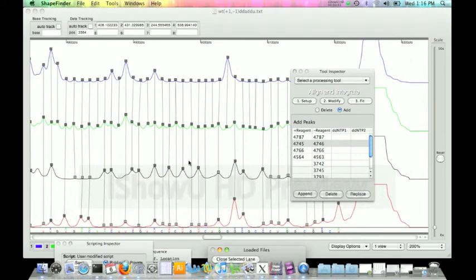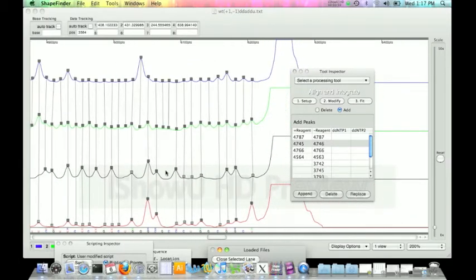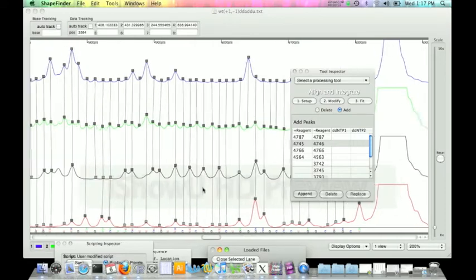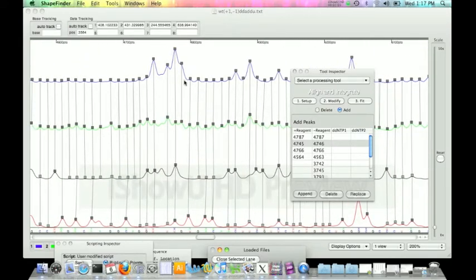So if we look in here, we can see that we've got some U peaks lining up, but we have our DDA ladder which finds U's and our DDU ladder which finds A's. We can see that it's not exactly the best lined up right now. So it's clearly missing some peaks in some certain spots. And look, here's a spot right now.